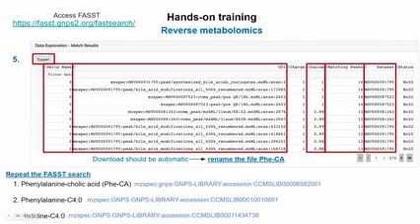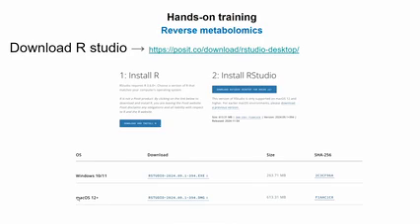There are USIs for each molecule, so you could repeat the fast search and export for each molecule, and rename it as written here in the slides. And I guess now, Vincent, you will take over. Yeah. We'll just wait 5 minutes so you can search all the other 3 molecules and give you enough time.